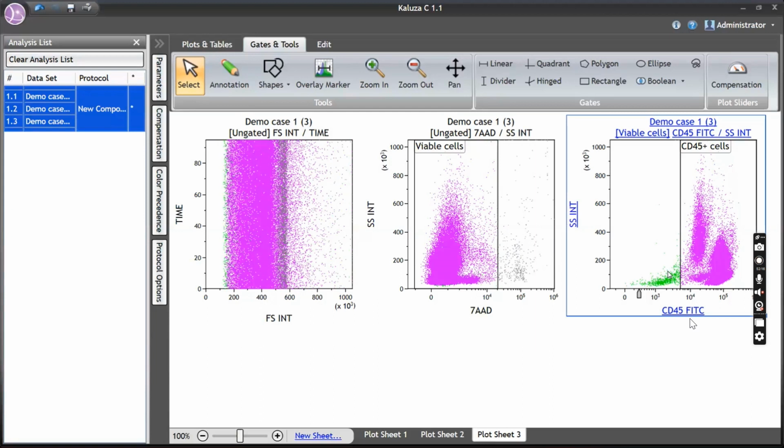So we will select only the bright cells. Dim to moderate, all those we will ignore. With respect to CD45, you say? Yes, sir. See, this is bright, I'm including till this. If you want, you can include till here. If you're not happy, sir, that is the moderate area, you still include, okay, I'll include this. But definitely not the negative. Sir, understood. Okay.